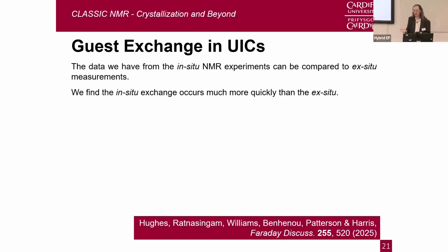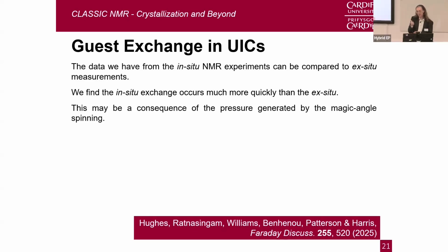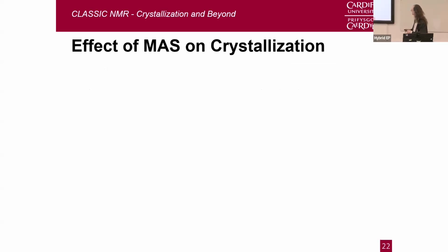Now, as I say, it's hard to be sure looking at those spectra whether it really has stopped growing. But we can do much longer timescale ex situ experiments, literally over weeks, and there we do still see a slow, steady rise in the replacement of the old guest with the new. So we may be shooting ourselves in the foot a little bit by stopping when it looks fairly flat, when in fact, if we had the time, we'd be able to carry on seeing it growing more. But it does look like it is quicker under magic angle spinning, and that's something we'll have to look at more carefully. That might be a consequence of the pressure that's generated by the magic angle spinning, a topic that I'm going to come back to in a moment.